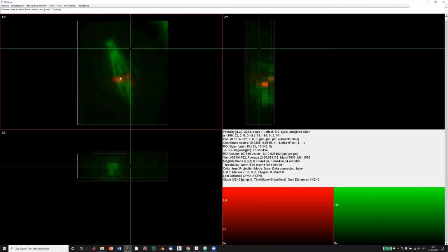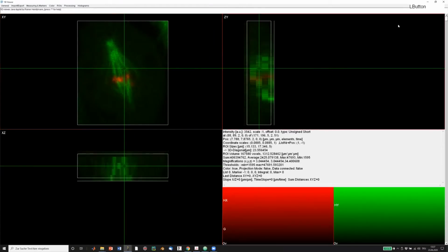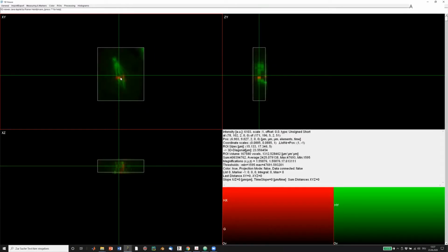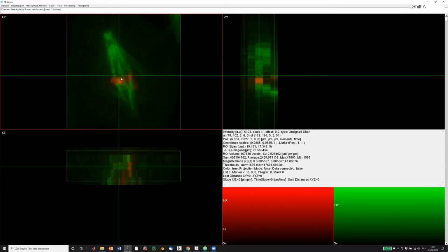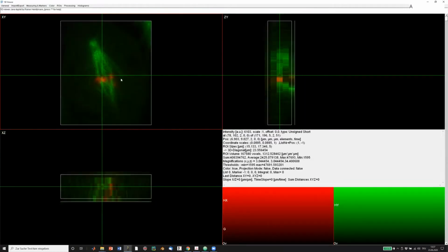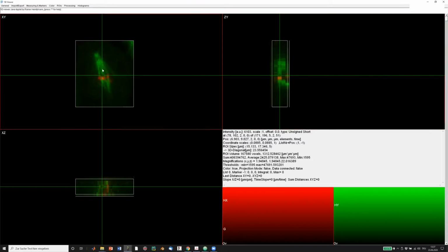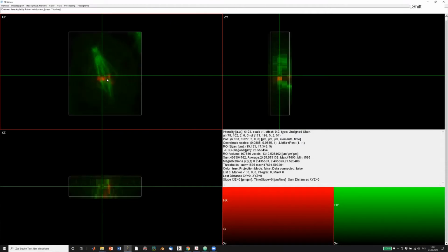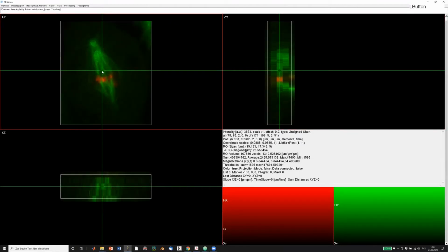To explain for you, if I press a key on the keyboard, you can actually see it popping up in the top right part of the screen because I've installed a little tool that shows you which letters I am pressing. That's the lowercase a, and Shift A would be uppercase A. As you see, Shift A zooms in, and small a, which is even shown as a capital letter, but it really is a non-capital a, is zooming out. So that you know how to interpret these things. I will try to say what I'm pressing, but sometimes I might forget.